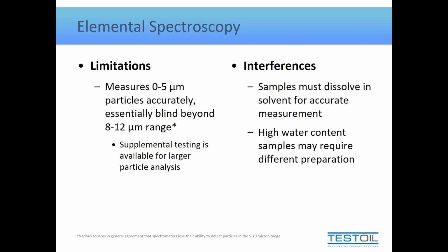a skylight, a 1 square foot window straight up into the night sky, and now try and imagine how much of the meteor shower can you see through that small window? Not as much. And could you differentiate small particles from large particles? Well, essentially, hopefully you're seeing where this analogy is going. And no, even if a large particle, a large meteor, streaked past that window, because you're looking at such a narrow point of it, you would perceive it as a smaller meteor because you would not know that it started streaking before it hit the window, and you wouldn't know if it was continuing to streak after it had gone past the window.